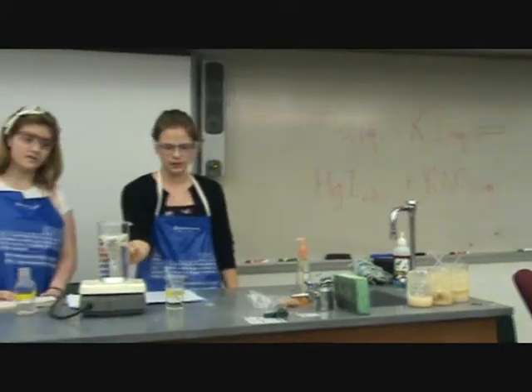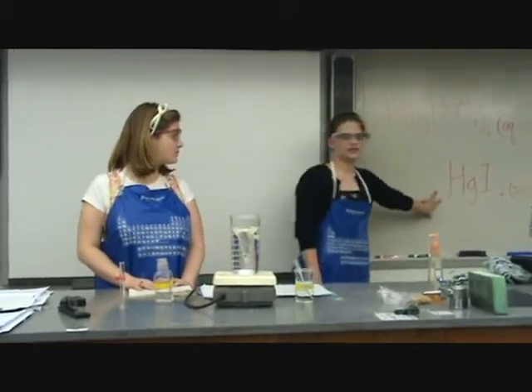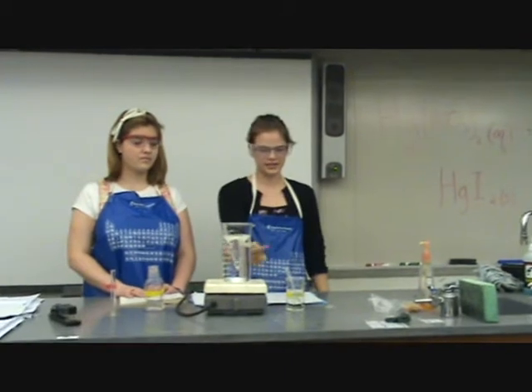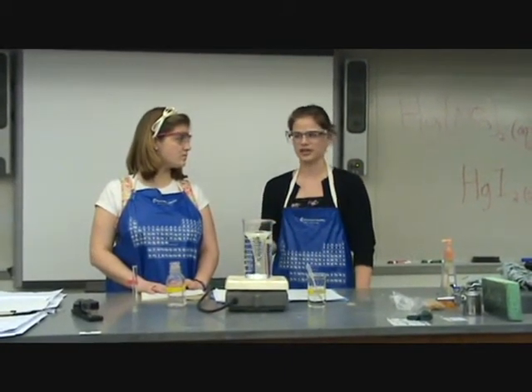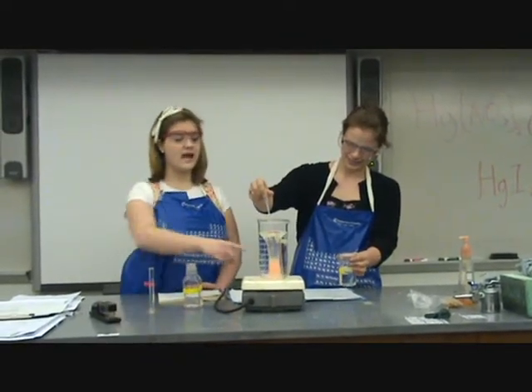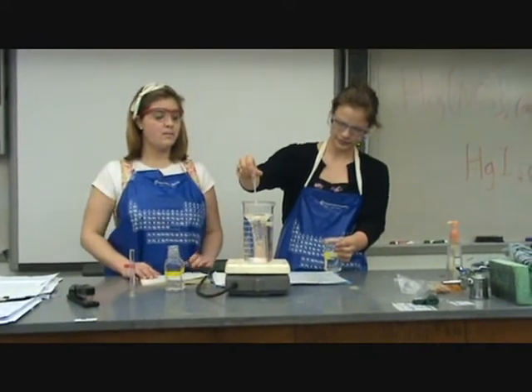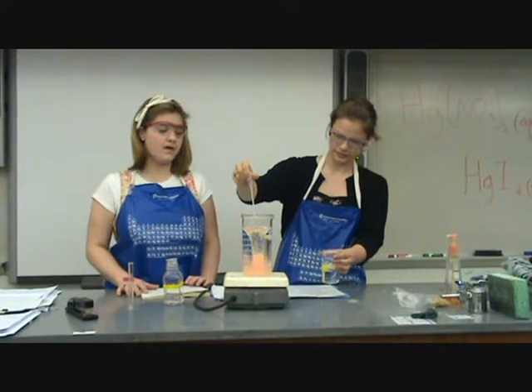Notice you only see it in the vortex for a short time, because at that time the concentration of the solid is greater than the concentration of the reactants, but only in the vortex. Once it escapes the vortex, the reactants are in greater concentration than the solid. So you can see that as it goes in, the concentration is very high and concentrated in the bottom of the vortex. Therefore, you see the color.